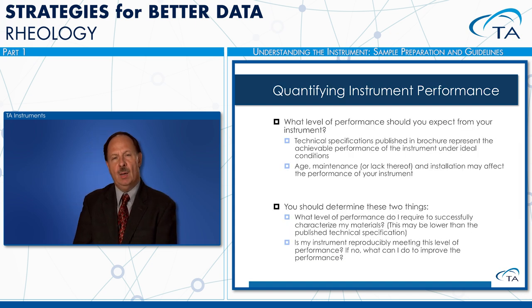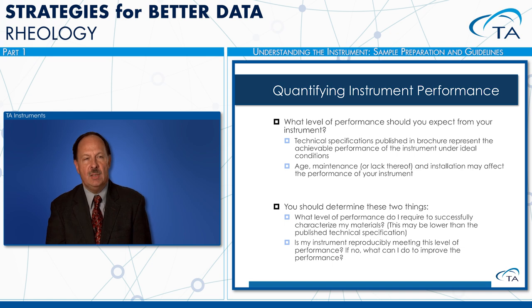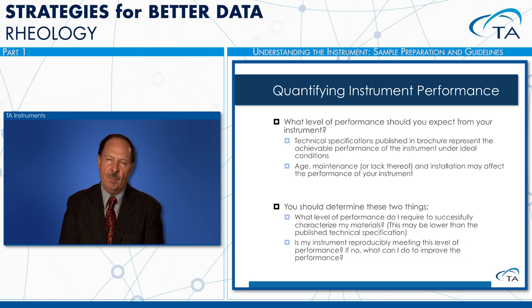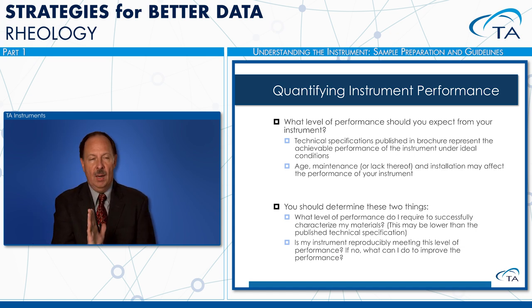Okay, so when you decide which rheometer you want and what testing you want to do, you would ask yourself, what is the level of performance that you should expect? Please realize that when we give specs, we determine those based on the best case scenario. Just like if you get a car and you get the highway mile per gallon rating, that's pretty much what we are doing here as well, in that under the best case scenario, this is what you'd expect. And this is good too, because you know that below that, the data are somewhat questionable. Sometimes we've seen people go half a decade or lower below the specs, and they'll still get good data. But we'll give you the specs that we are comfortable with in a best case scenario.